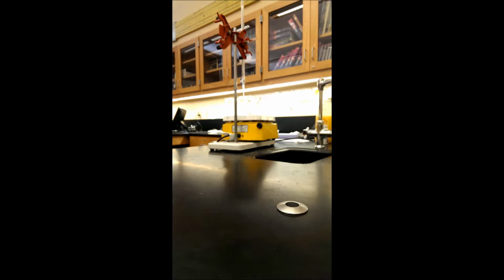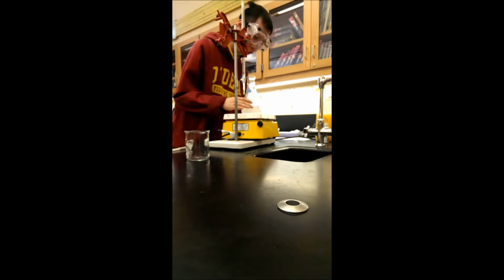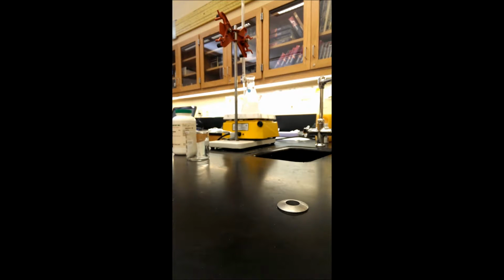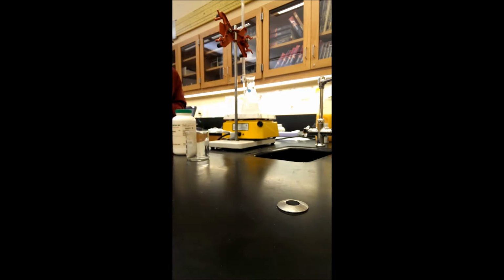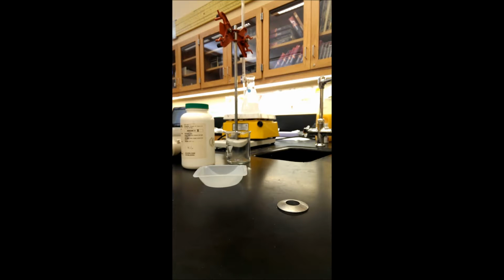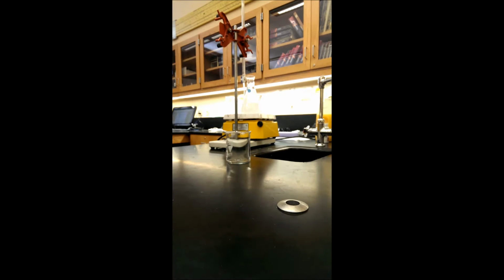And so here we're just setting up the titration yet again. And so this was a lot faster this time around because I was familiar with what I was doing. So for the analyte solution, I was using 5 milliliters of the same orange juice, 10 milliliters of the starch solution, and 150 milliliters of distilled water.